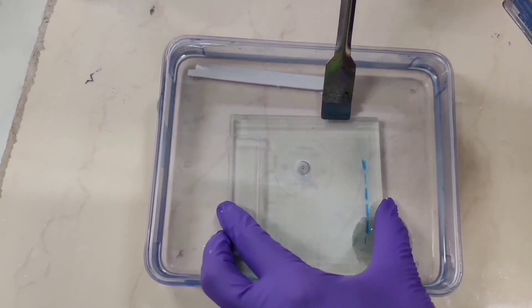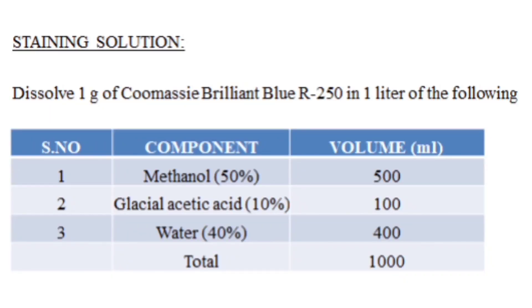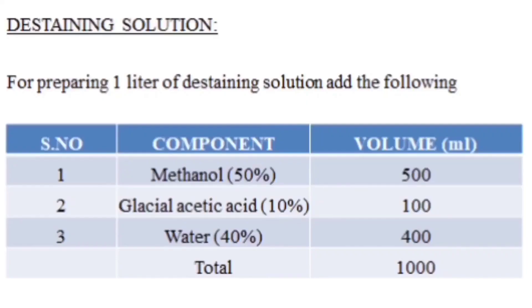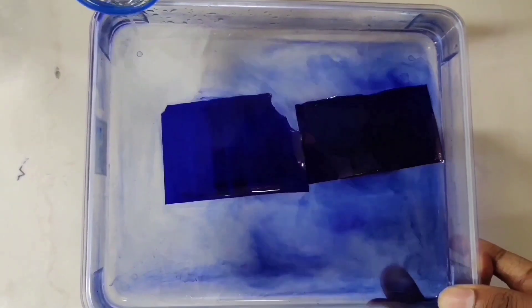The gel from the apparatus is removed from the glass plates. Place the gel in a small tray and wash it with water, after which we prepare the staining solution. We let the gel sit in the staining solution overnight on a rocker until the gel is completely stained. This stain will permeate the gel, stain the protein, and also fix the protein in place. Then we remove the staining solution and add the destaining solution to the gel for almost 2 hours. After the destaining solution is removed, the gel is visualized in white light. The proteins appear as blue bands, and the gel can be stored in water.